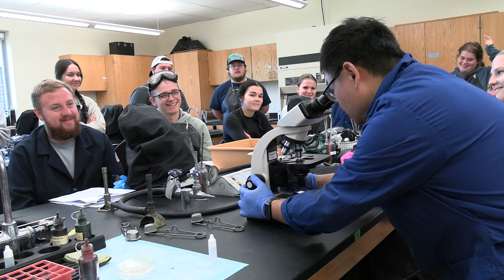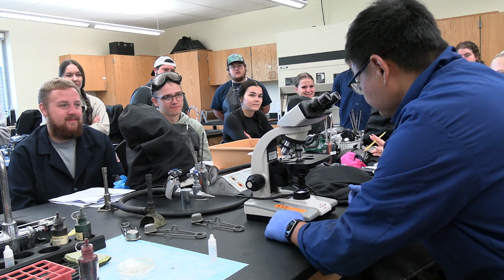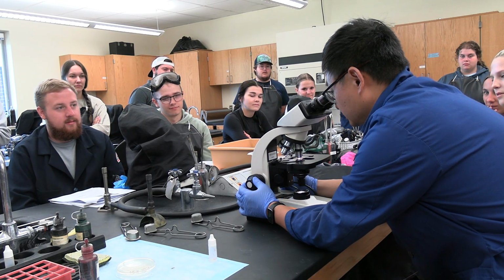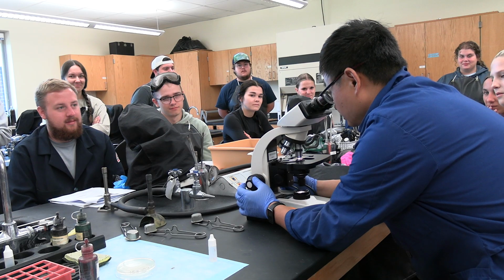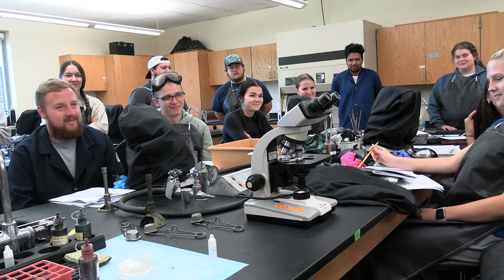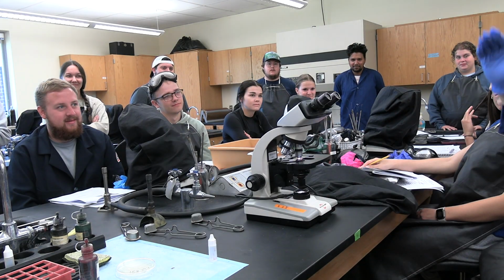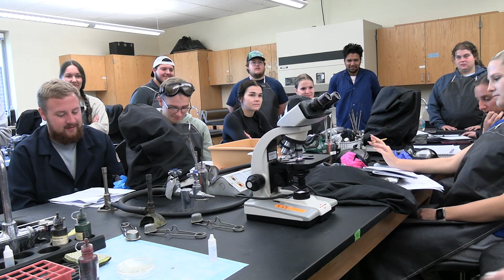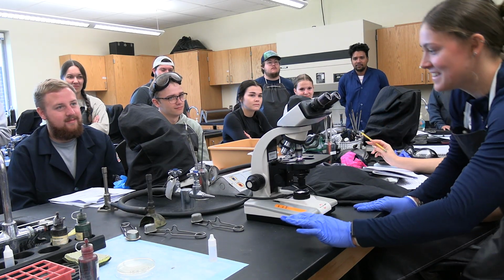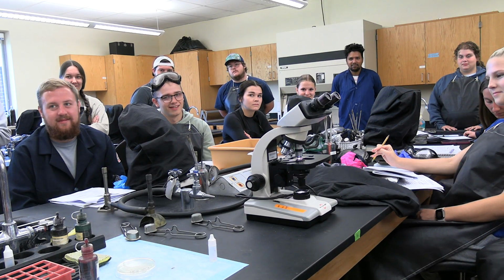Okay. But the thing is, for me, it looks like it's bacillus. It's not E. coli because it's very long. We'll see. Come here to see. That's what you can see under 100x with oil immersion. That's a very long rod. See it? Okay. See it again. That's what 100x looks like. Come to see it. Double check.